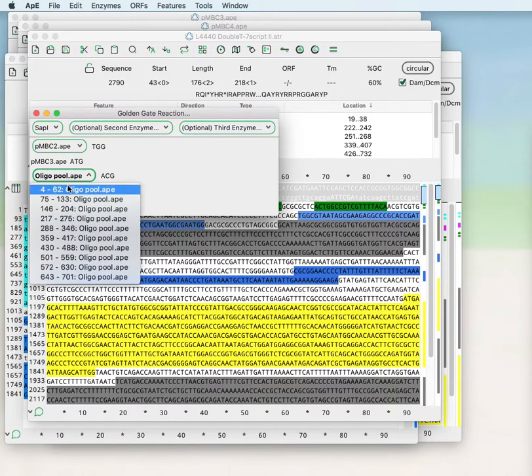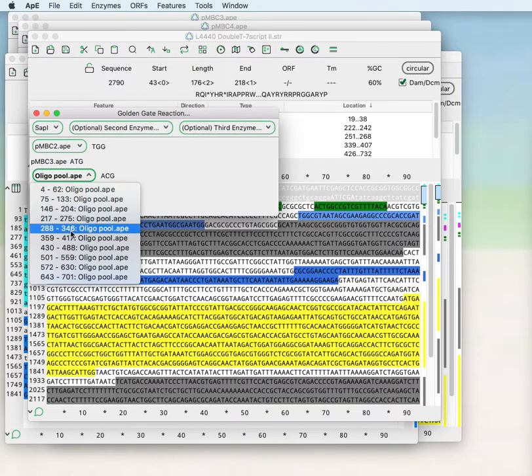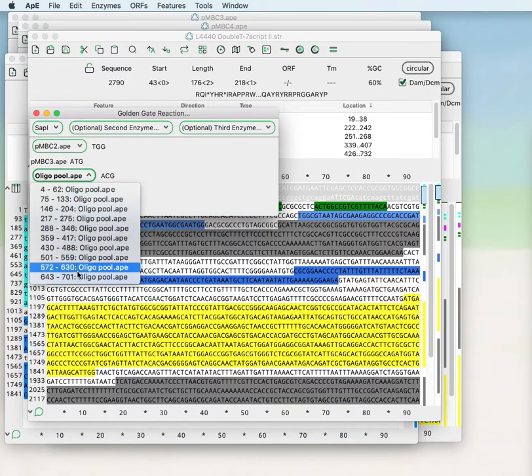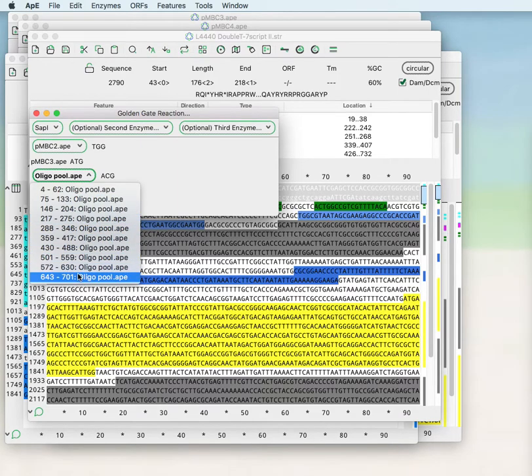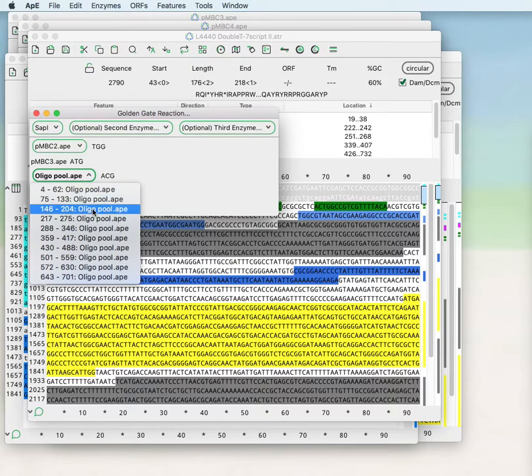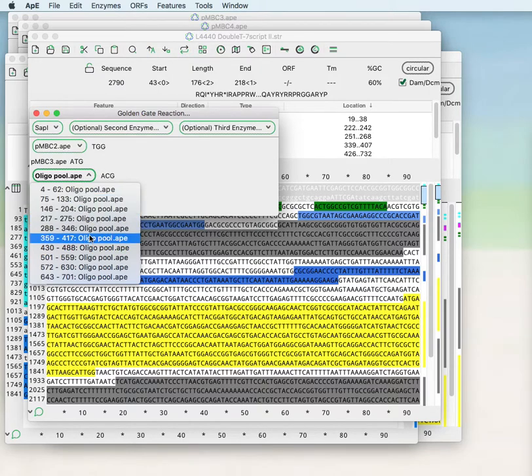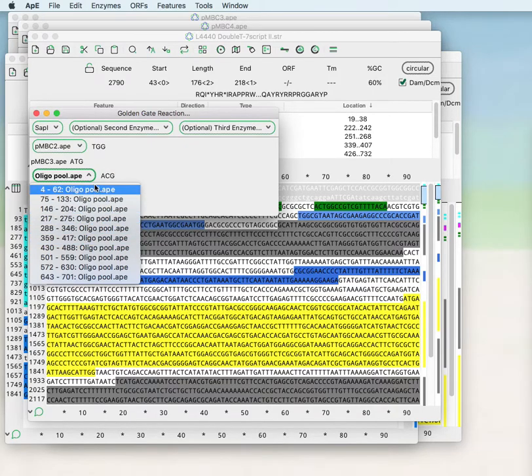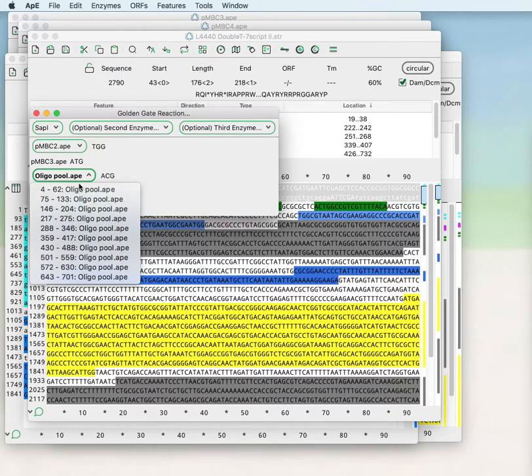So if you add all of these oligos into a single pot reaction, you can generate a Golden Gate reaction that has all of these different oligos ligated all at once or individually. And each one of the colonies will have one of these library components. So then you can screen those for functionality of the protein.